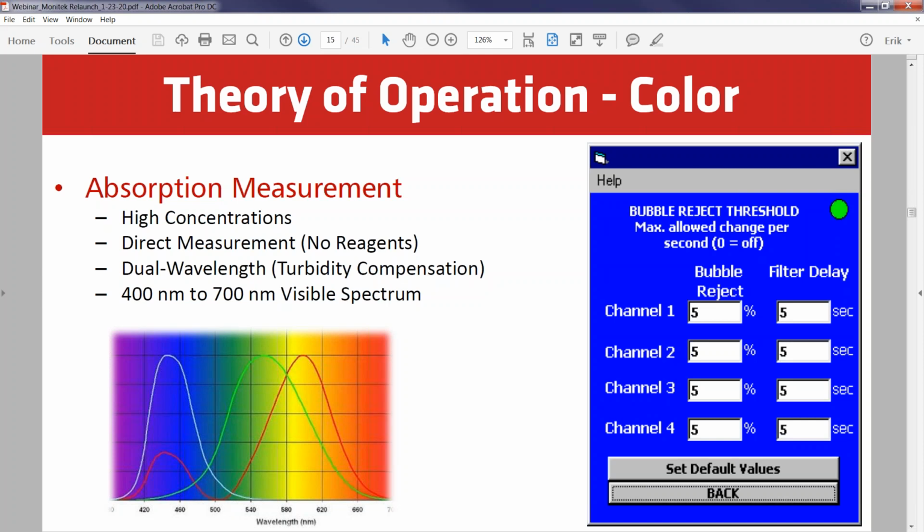It looks more yellow in color. And of course, diesel goes darker than that, and so forth. So that is a very typical measurement, and that is where we would do that. So 450 nanometers is the measure on that, and 850 in the infrared is the reference.